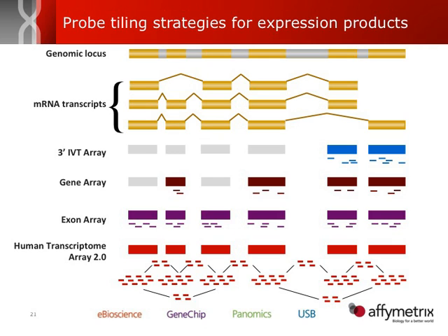So not only are we getting more robust exon level signal, but we've also included these spliced junction probes as well. Wherever we have a known spliced junction, we tile 4 probes down to that spliced junction. So now we can combine exon level information with the splice level information and start to get a much more complete view of the alternative splicing that's happening.